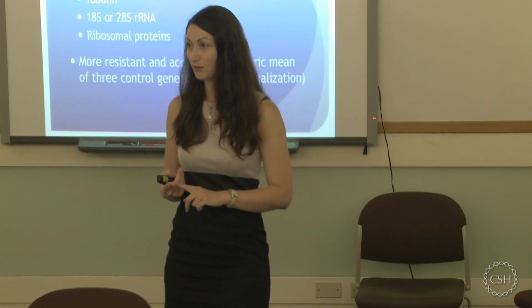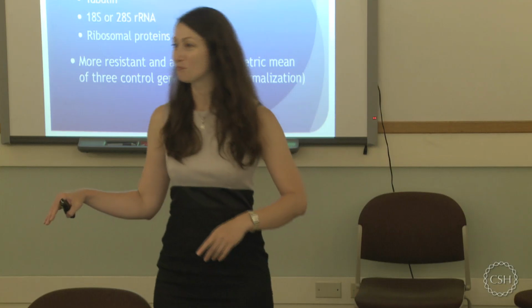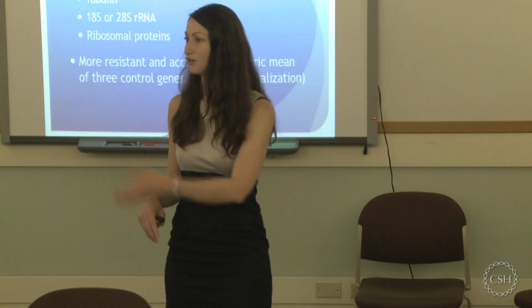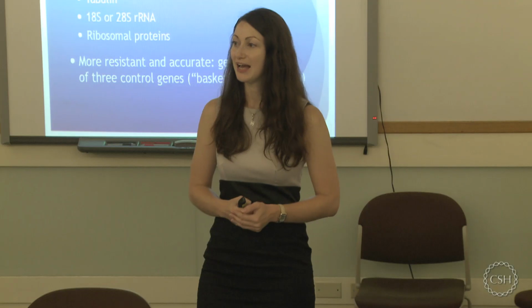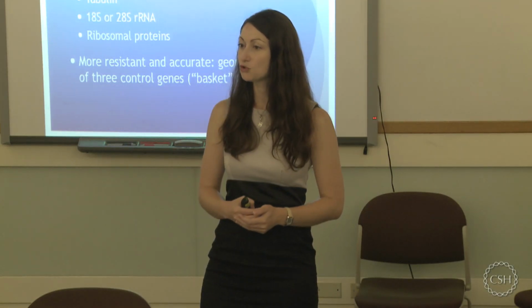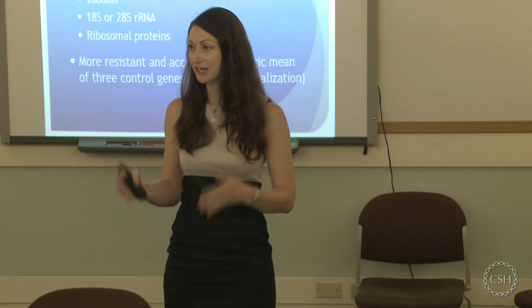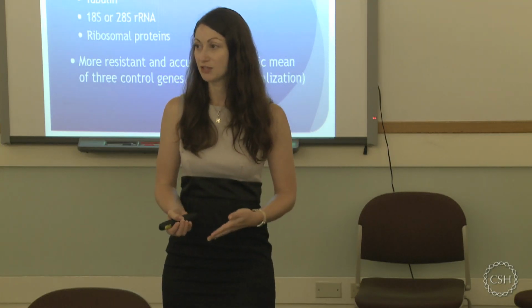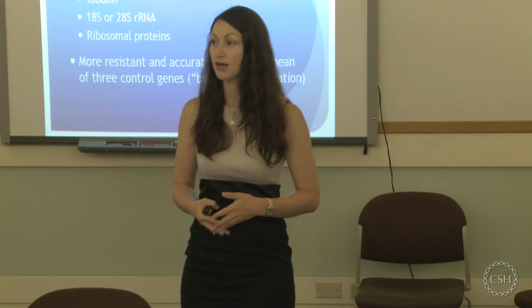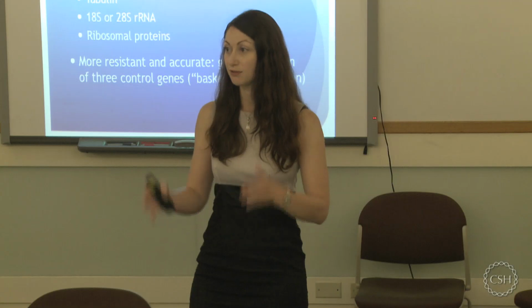So that's certainly one thing if you're really worried, and that's also what I did during my PhD. I did a dilution row. So I actually made cDNA of 10, 100, 1,000 nanograms, or you name it, whatever you want to use, and checked if there is any difference if I use different amounts of RNA starting material, and what would be the optimal range for me for my assay. So if you really want to make it 100% correct, go for it and do an RNA dilution row first for your cDNA synthesis and see what's your stable linear range.